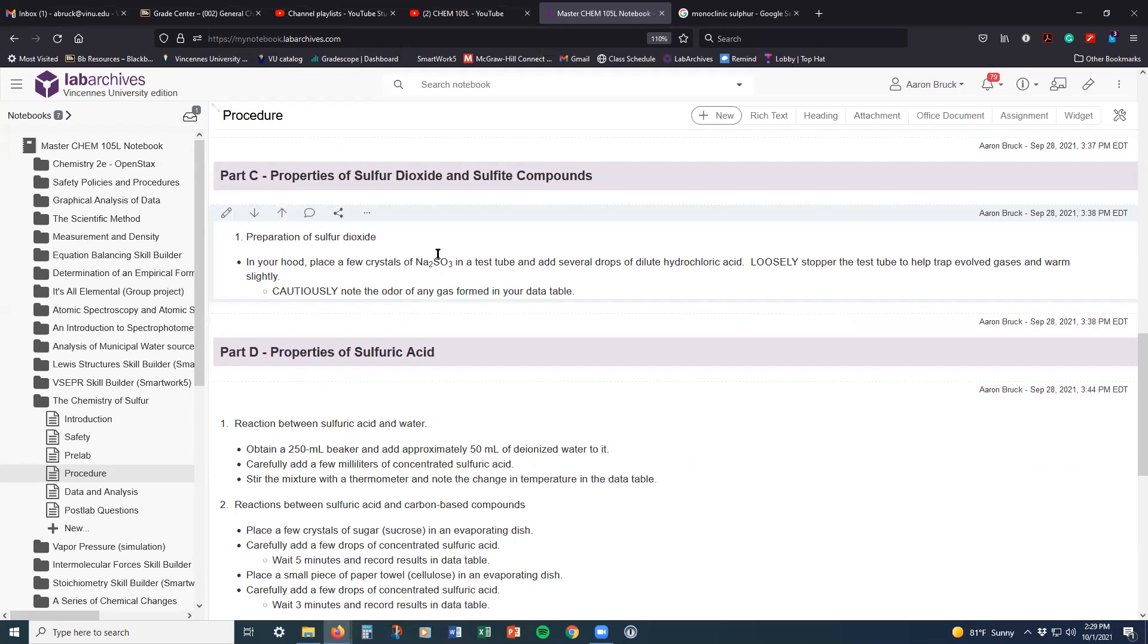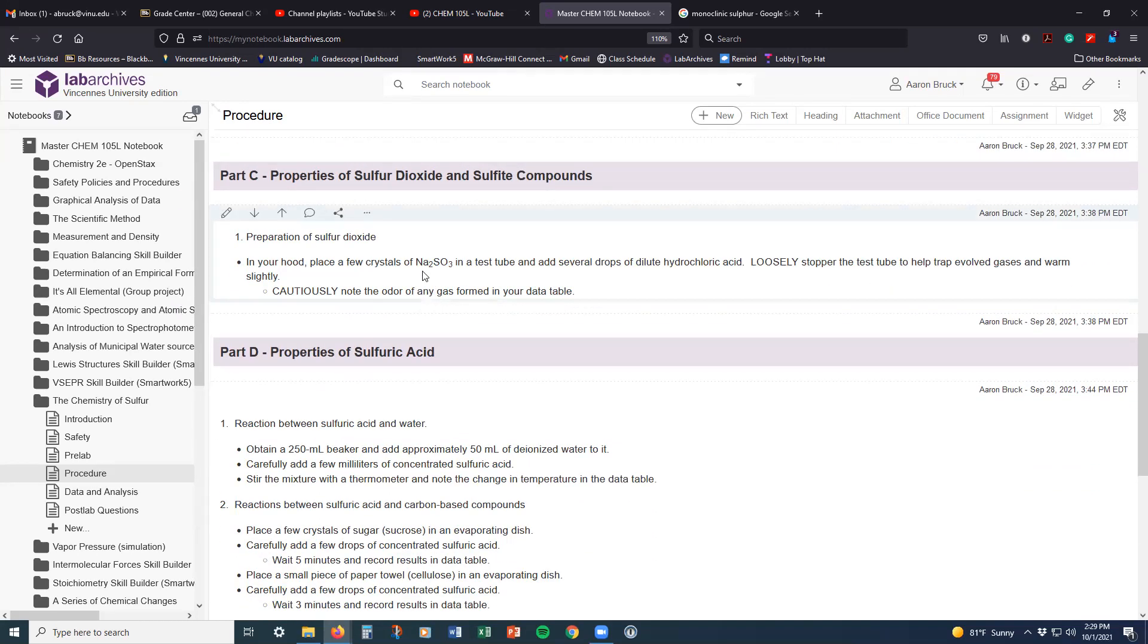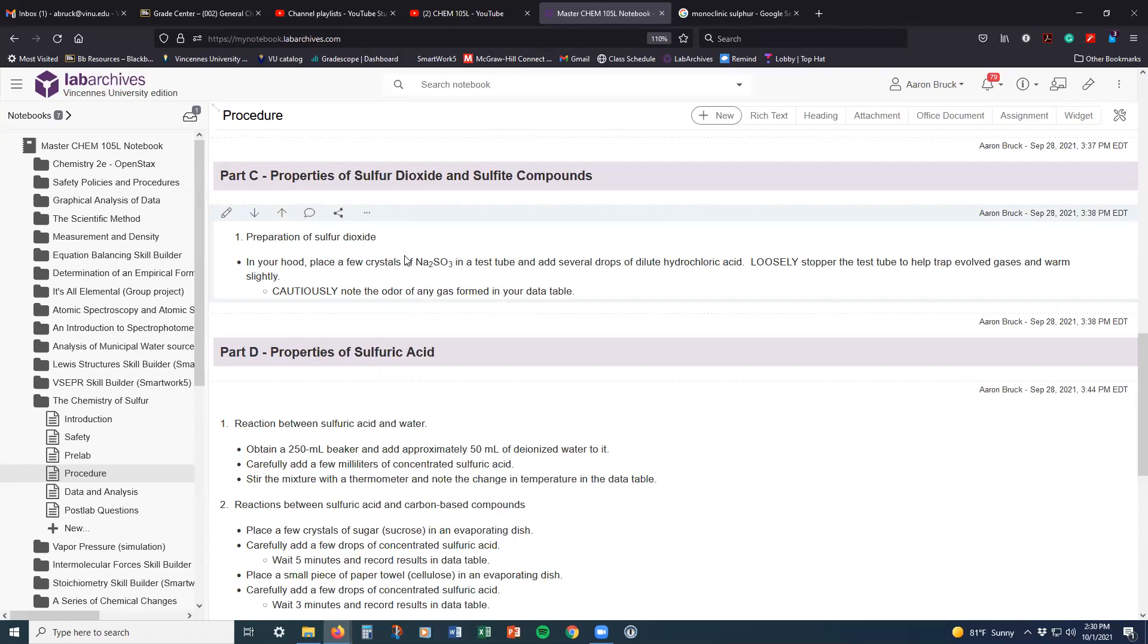In part C, we will make sulfur dioxide using sodium sulfite. And so we'll get some idea of the properties of that. One word of warning as we do that, the sulfur dioxide that is created is extremely pungent. And so we're going to be very careful when we go about testing that and trying to observe its odor.